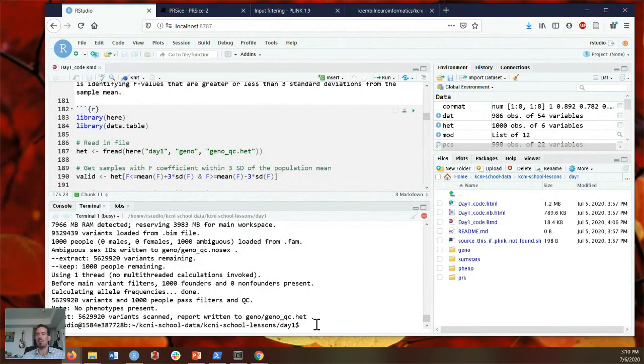We want to now apply our own threshold, and we want to say, well, what do we believe constitutes an excess or not enough heterozygosity as expected? What do we believe lies outside of our distribution of heterozygosity? And that will be, in some cases, population specific. It's something that will be specific to our observed distribution of heterozygosity rates.